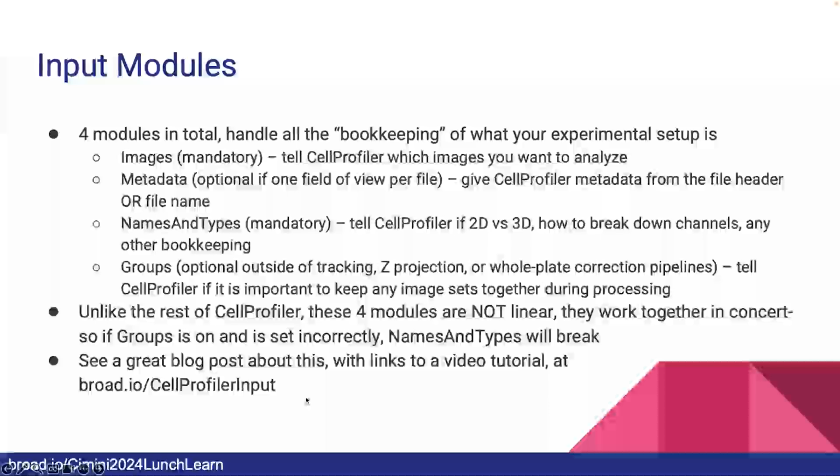We have a tutorial that has a linked video of the top 10 most common kinds of experiments people want to do, and how to set these modules up so that you can do them. Again, it's got a timestamped video and a written version. And if you have trouble, there's going to be lots of information about how to get help at the end. I know this part's going to suck, and I apologize in advance. It's as least bad as we figured out how to make it. If you have an idea how to make it even less bad, come talk to me.